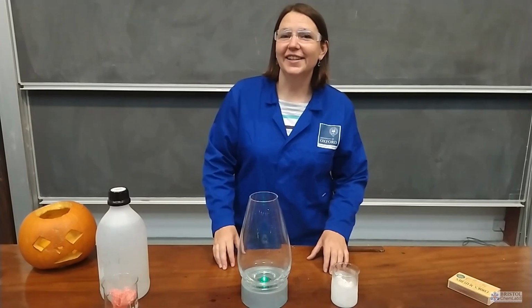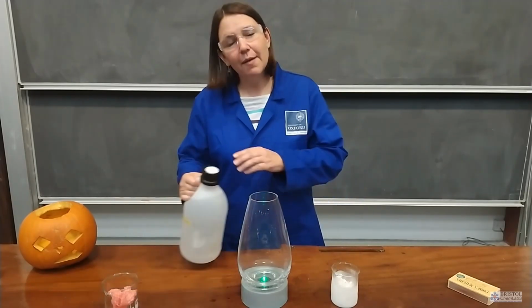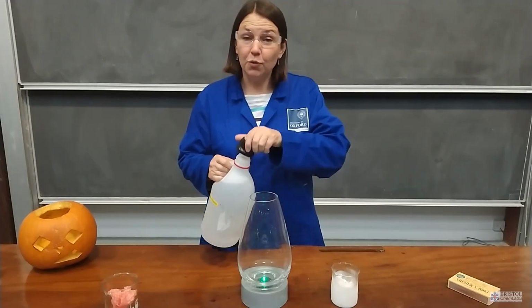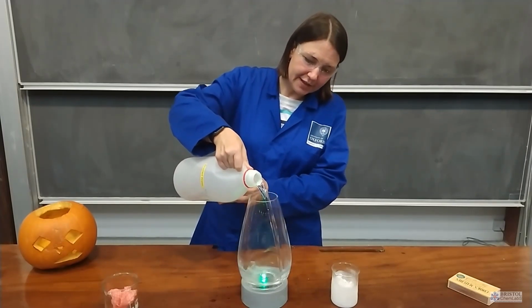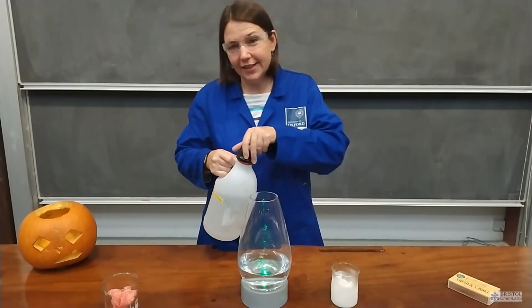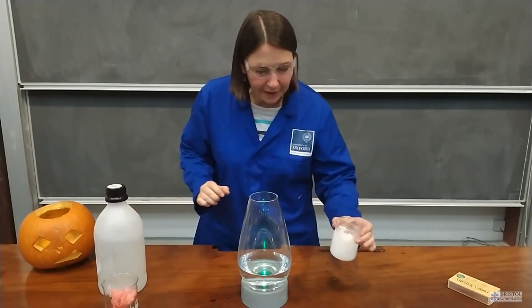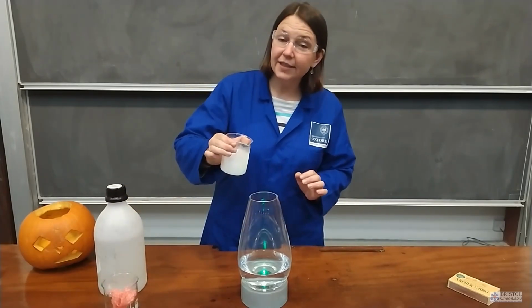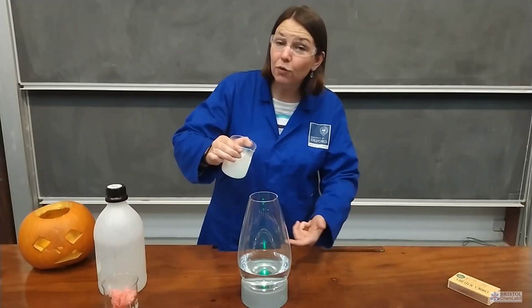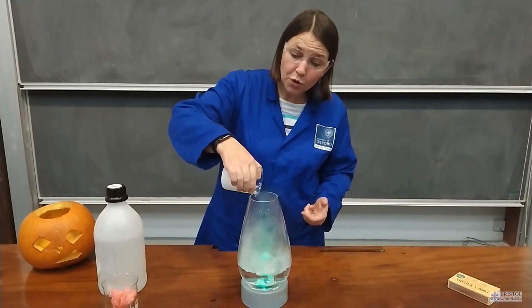So we've already seen that carbon dioxide gas is more dense than air. What I'd like to find out is what happens when you put carbon dioxide into water. I've got some distilled water here, let's pop some in. I've just added a light underneath so that you can see a little bit more about what happens. I'm going to put some pellets in. Now what I'm expecting is that there'll be greater surface contact between those pellets and the water, and so they'll warm up more quickly.